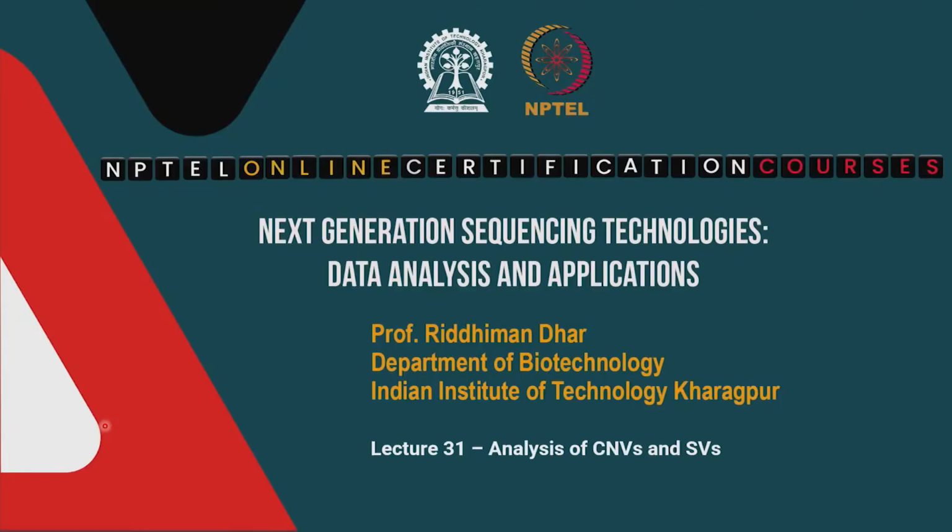Good day everyone, welcome to the course on next generation sequencing technologies, data analysis and applications. In the last few classes we have looked into the analysis of variants and the different types of variants. We have focused mostly on single nucleotide polymorphisms or SNPs and small indels. In this class, we will look into the analysis of CNVs or copy number variations and structural variants. Okay, so let us get started.